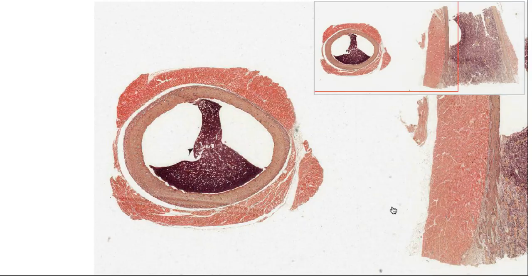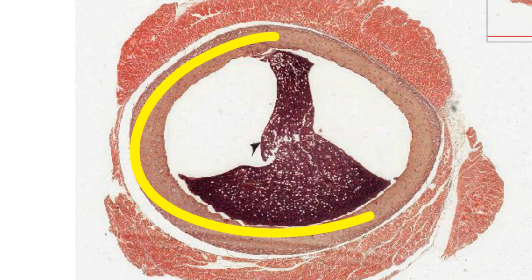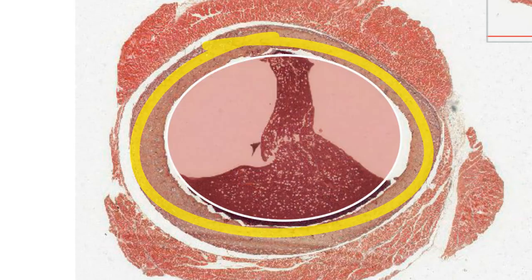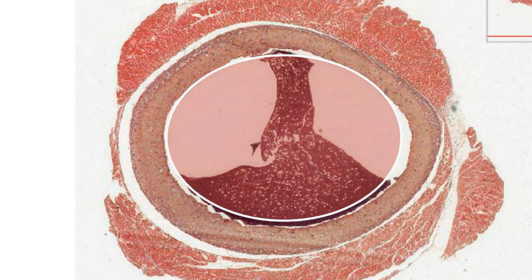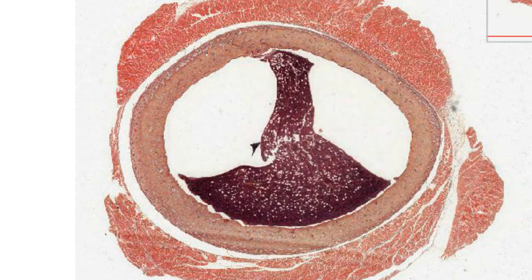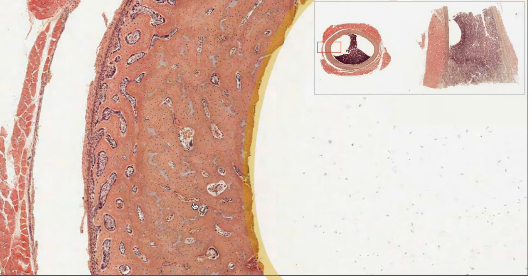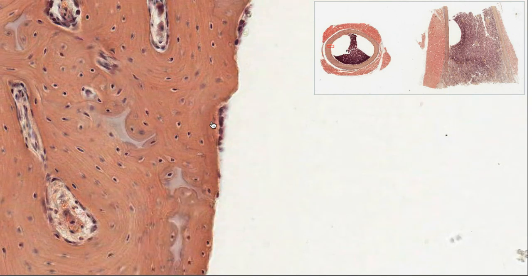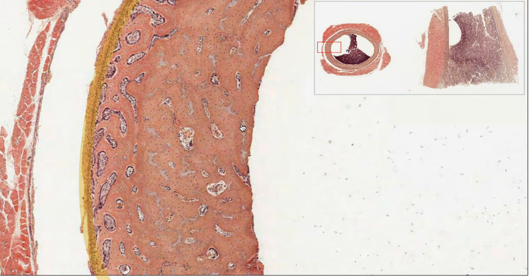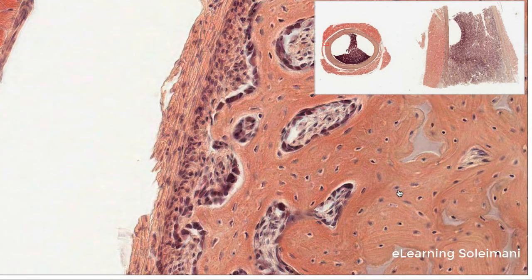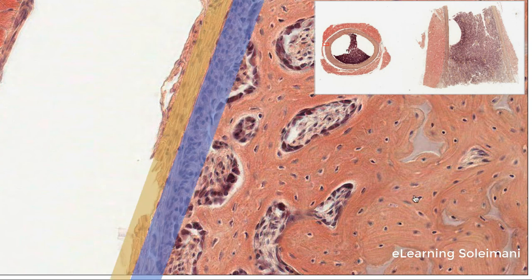In this slide we have a cross section of compact bone. The bone marrow located at the center of this bone is clearly visible. Adjacent to the bone marrow lies a layer known as the endostium, which contains osteoblasts. The outermost layer of the compact bone is called the periostium, which is composed of two distinct parts.